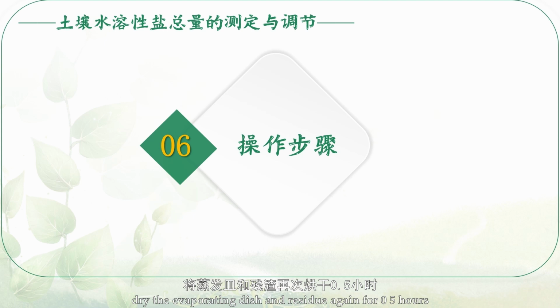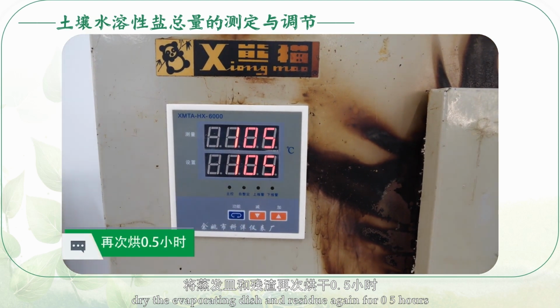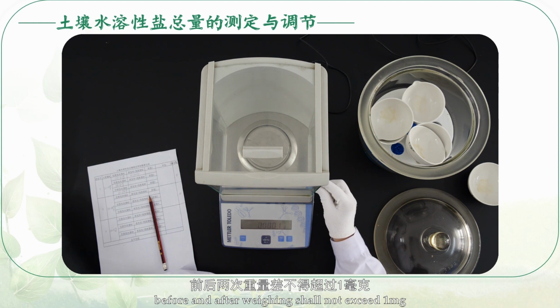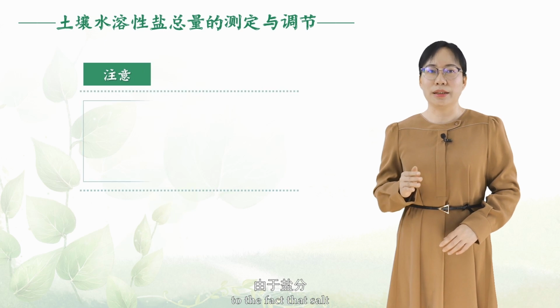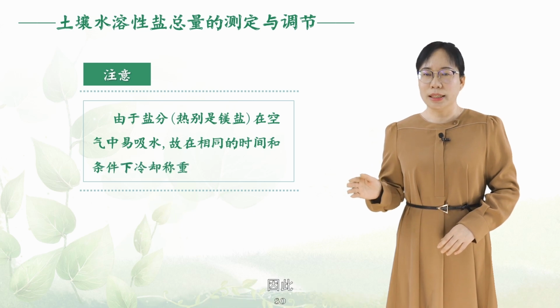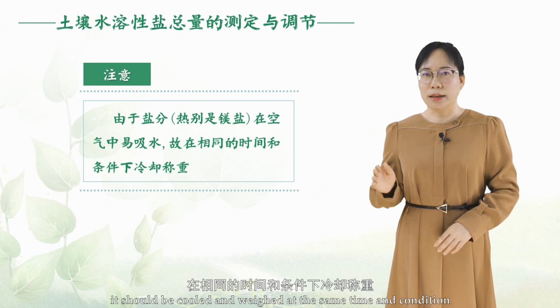Dry the evaporating dish and residue again for 0.5 hours, and the weight difference before and after weighing should not exceed 1 milligram. Pay attention to the fact that salt, especially magnesium salt, easily absorbs water in the air, so it should be cooled and weighed at the same time and condition.